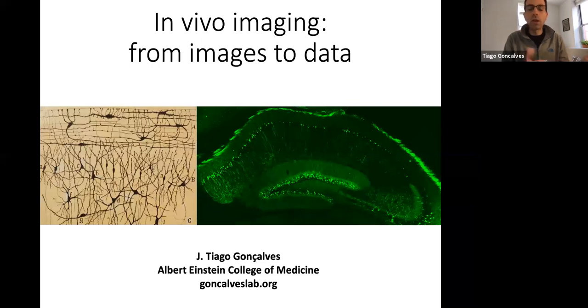And there are already other people who have, initially the plan was to go a little bit over the calcium imaging analysis, and we're going to do that. I'm going to recommend a bunch of other resources for you to follow if you're interested in a webinar kind of experience where you follow a particular pipeline for analyzing data. But here we're going to cover things at a more general level. So not covering one particular tool, but covering what's around.